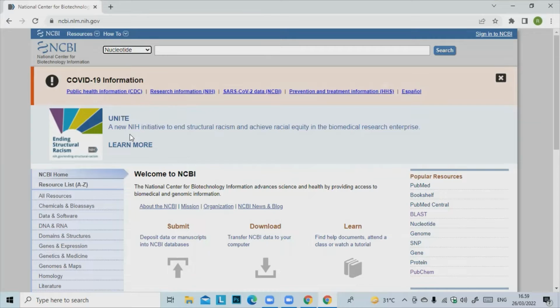In the search bar, insert your query. You can use the name of an organism or a specific gene. In this video, I want to find Oreochromis niloticus, gene COI. Okay, I will search Oreochromis or tilapia fish. And click enter.